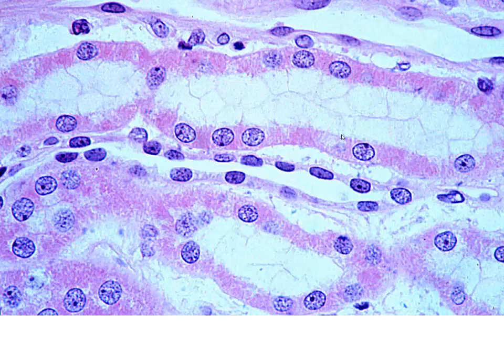Here we are in the medulla once again, and what we can recognize in this right away is we have a very, very thin set of cells here, nuclei in every place, almost squamous in nature. This is going to be a thin limb of our loop of Henle. We're only going to find this really down in our medulla. And as we look at this, we can see structures such as this somewhat shares characteristics.